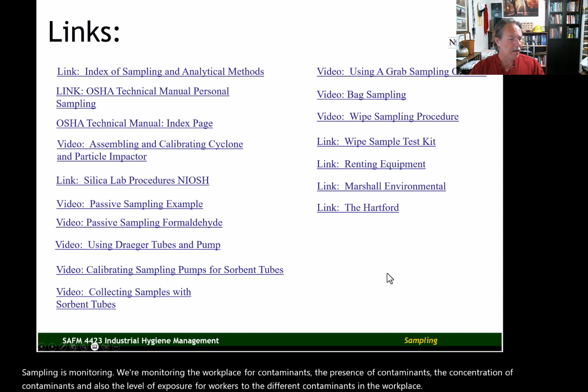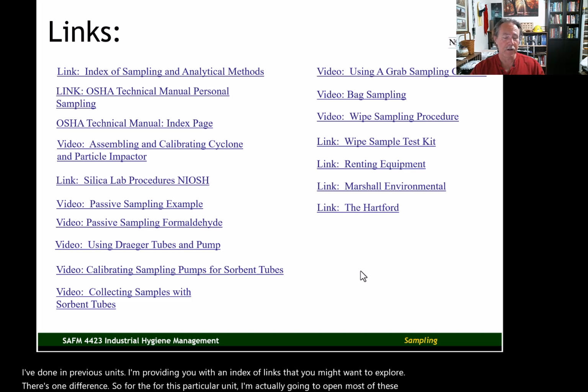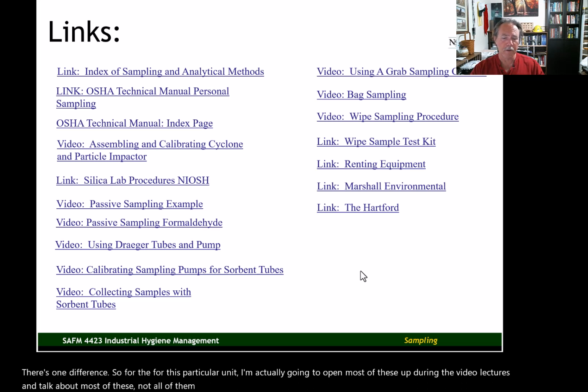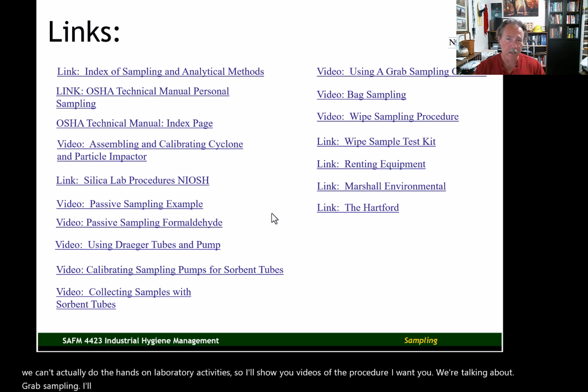Like I've done in previous units, I'm providing you with an index of links that you might want to explore. There's one difference though for this particular unit. I'm actually going to open most of these up during the video lectures and talk about them, especially the videos. Again, we can't actually do the hands-on laboratory activities, so I'll show you videos of the procedure. And when we're talking about grab sampling, I'll show you a video of how to use grab sampling equipment.